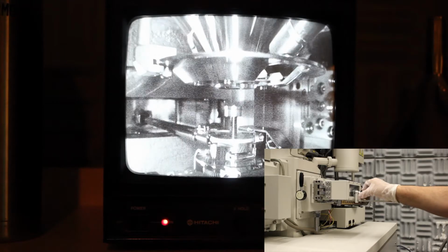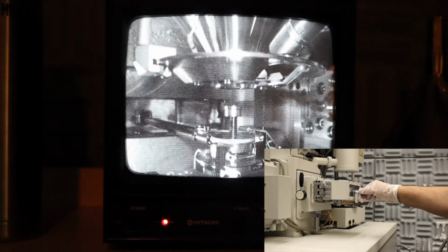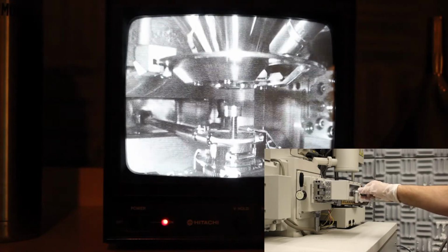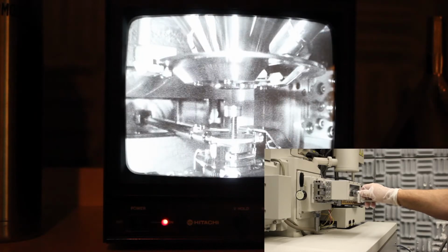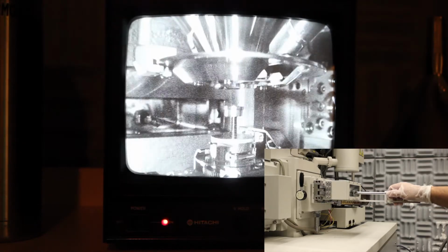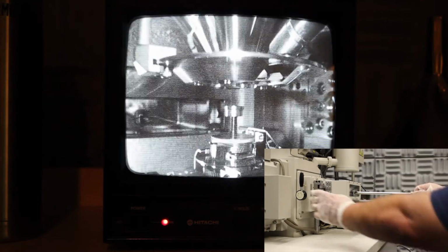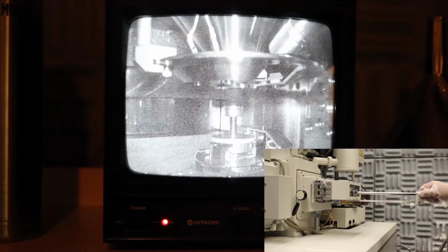This again will take about 20 turns in the opposite direction as we're unthreading. Once you think you are there, just slightly pull back to make sure you have disconnected. Look on the monitor again, and we're good to go. I'm now retracting this slowly. Now before you get to the end, close the manual valve. This is important. Before you lock. This is to protect this seal.